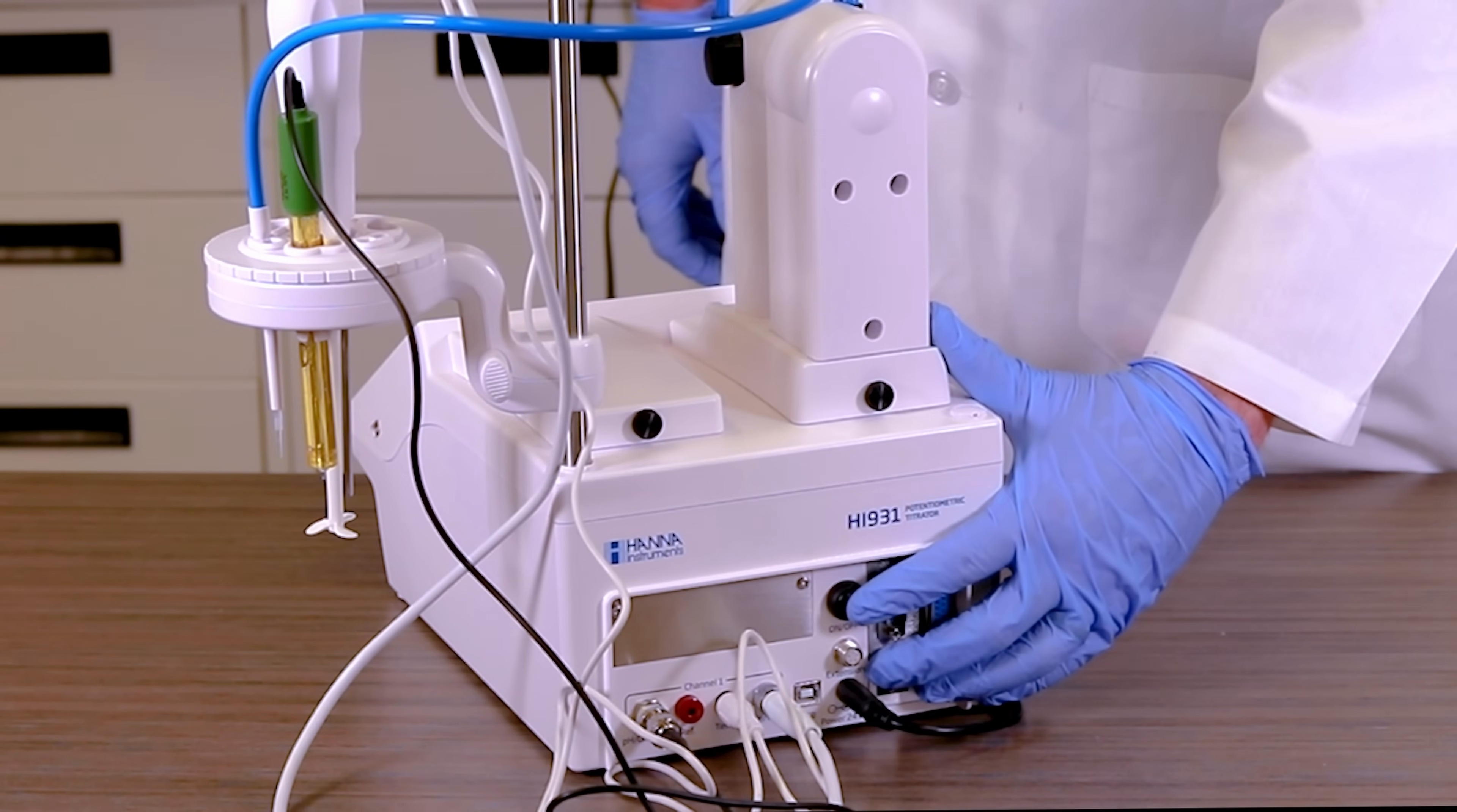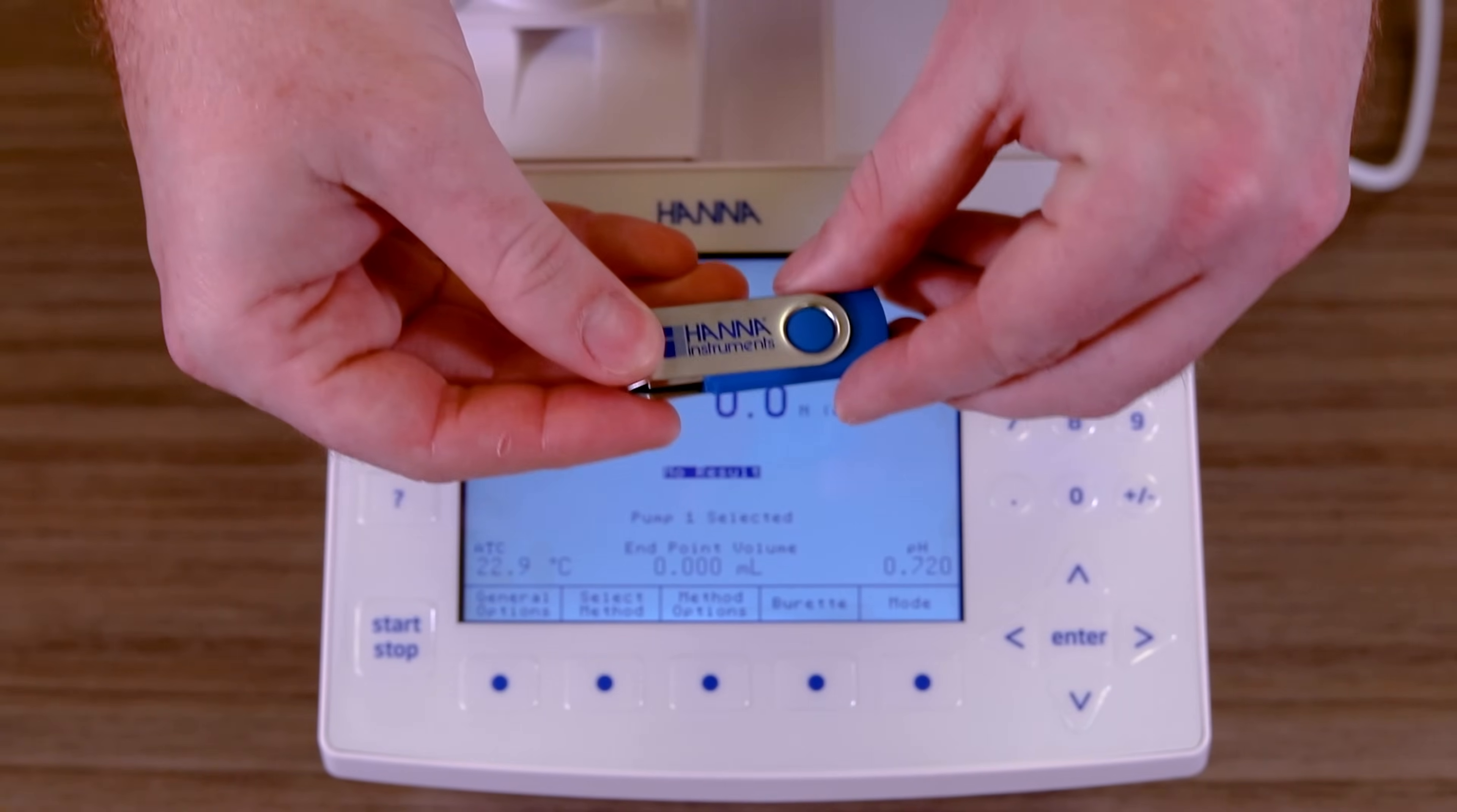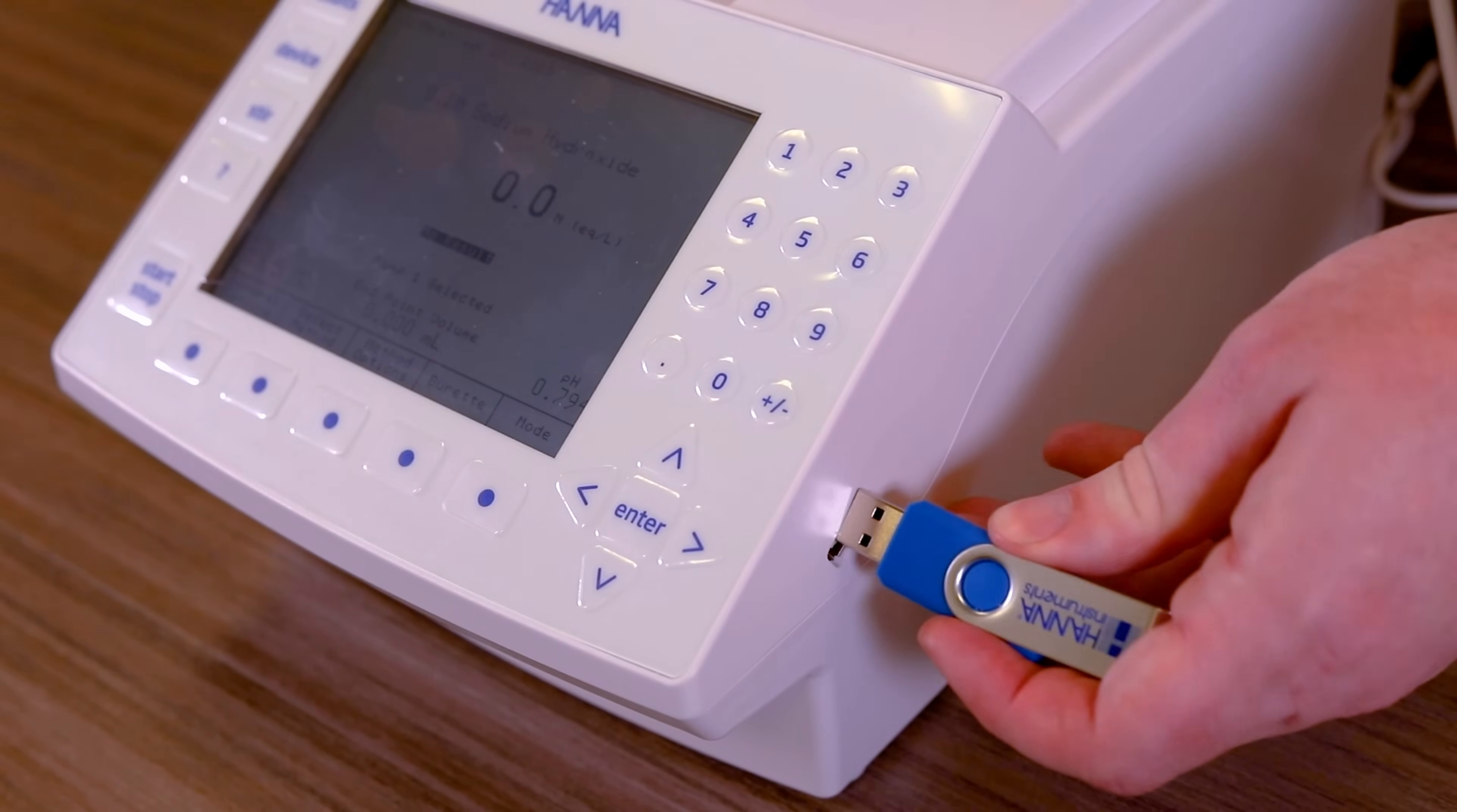Press the power button located on the back of your titrator to power on the unit. Your Hanna titrator is now installed and ready for use.